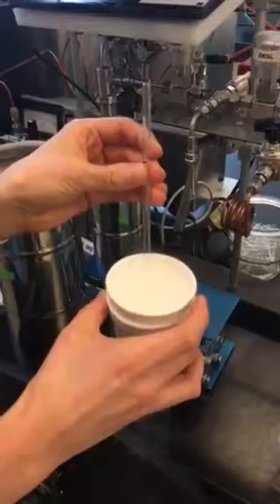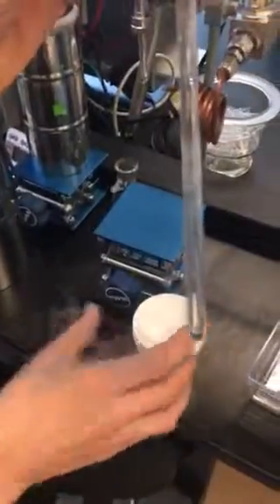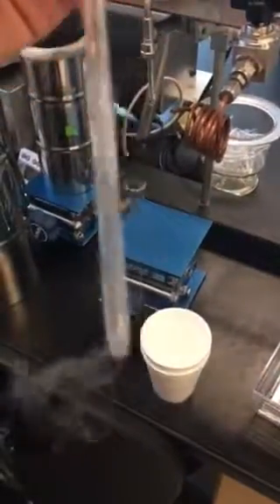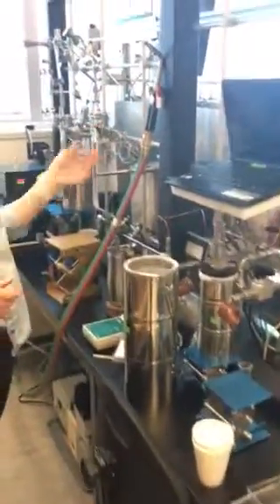This is just basically a glass tube. So do you hear that fizz? If we look now, you can see a little bit of haze on the inside. So that's basically CO2. With an actual sample though, you're gonna have a nice little ice block. And then we light the torch and flame seal the sample.